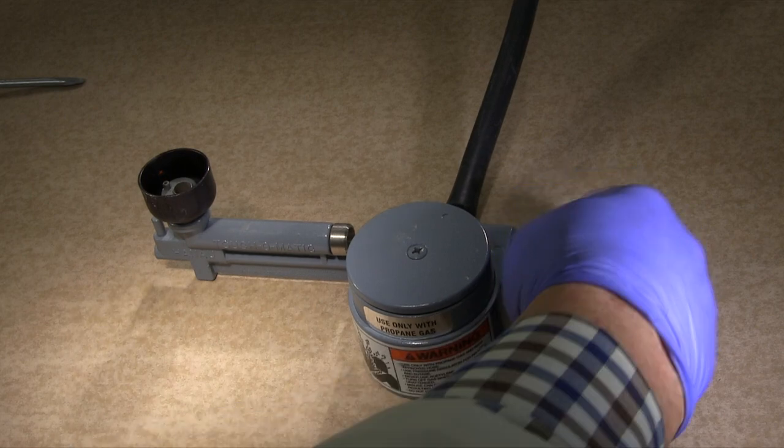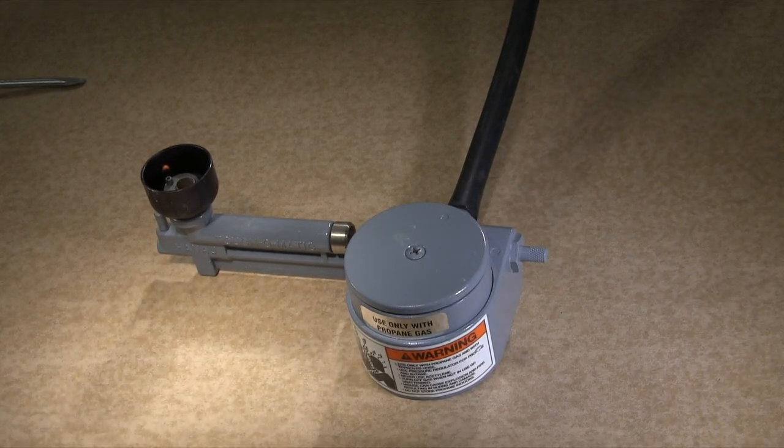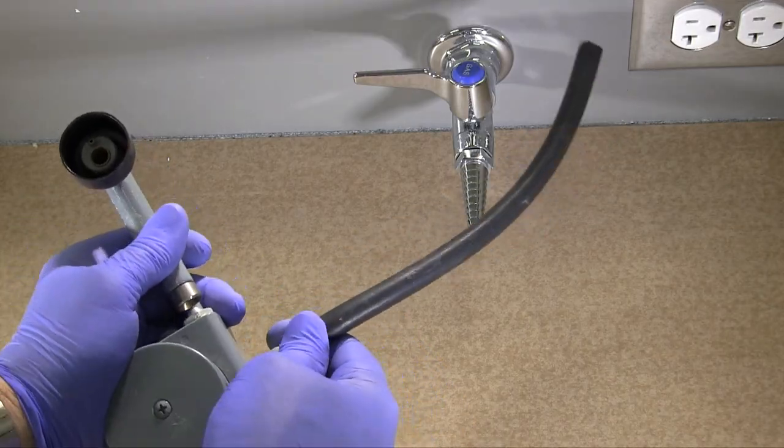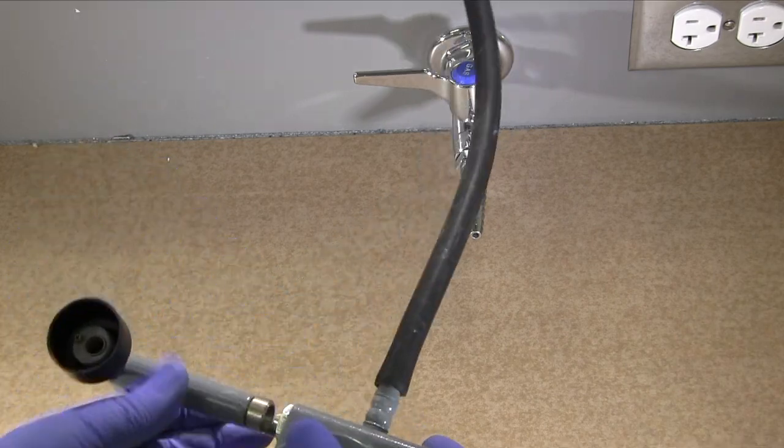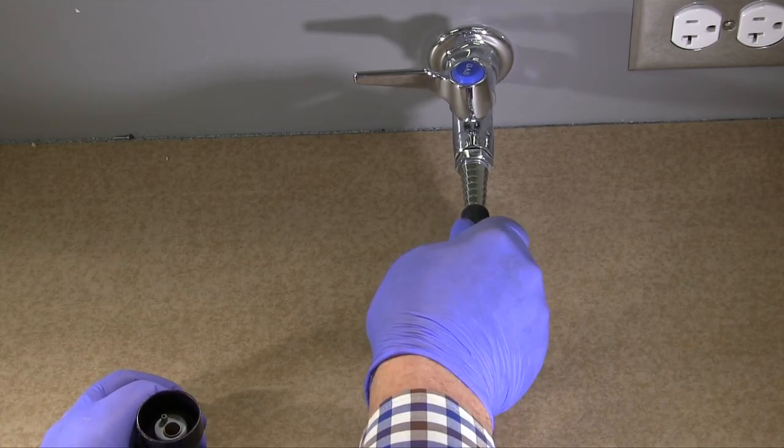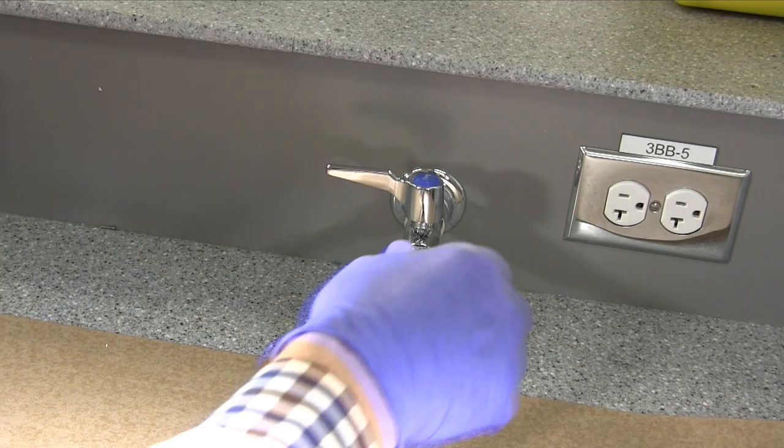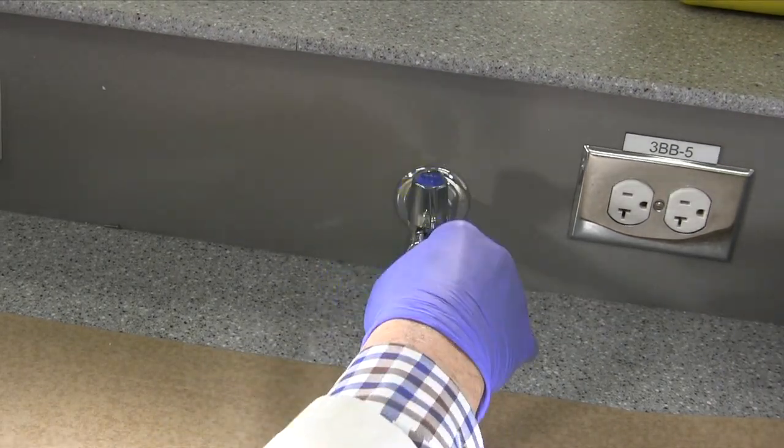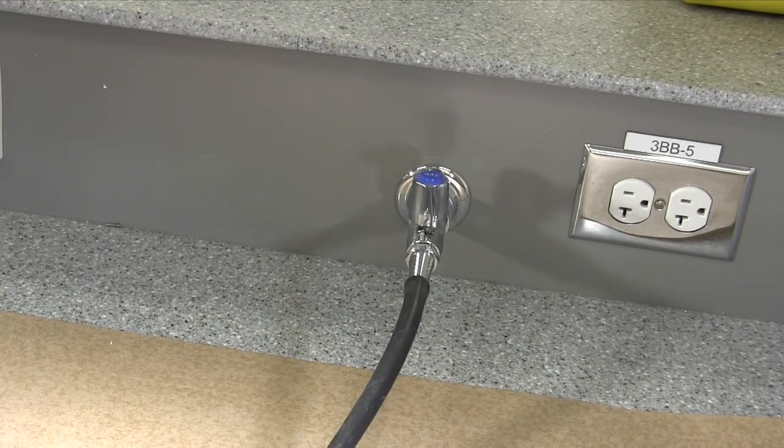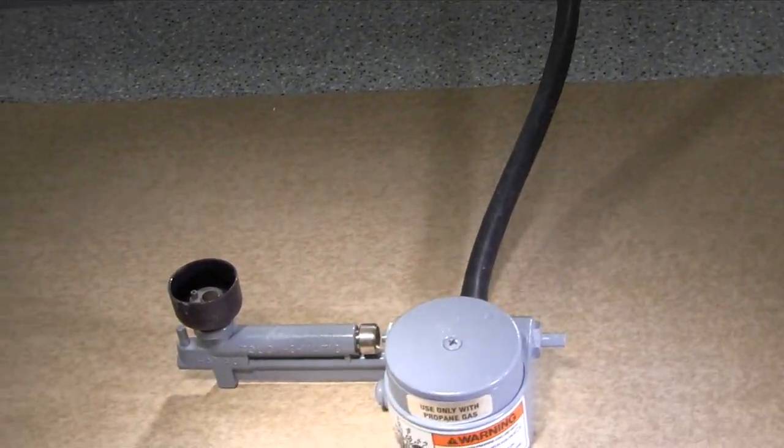To use the burner, make sure the gas adjustment screw is turned completely clockwise to the off position. With the gas off, attach the gas hose firmly to both the burner and then to the source. Turn the gas source lever on, and then make sure there is no smell of gas. That would indicate a leak.